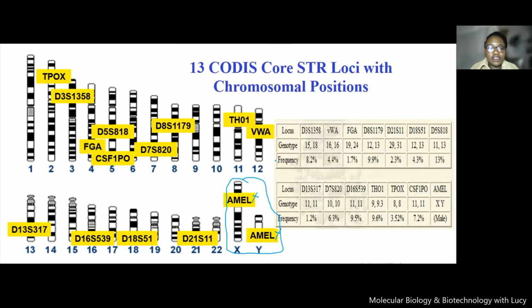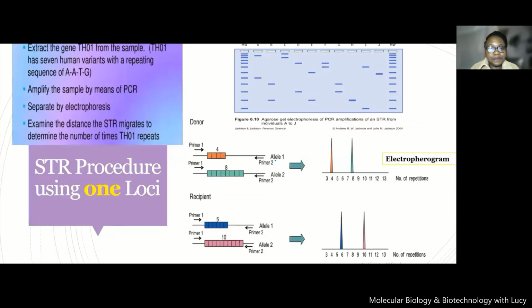So in short, we always have to have a specific marker that we are targeting, because even the process of hybridization uses a specific complementary strand. So we must know, in all the individuals that we are testing, whether they are 10 samples or 20 samples, that we are using TPOX, for example, or TPOX, TH01, and VWA at the same time, or even all 13.